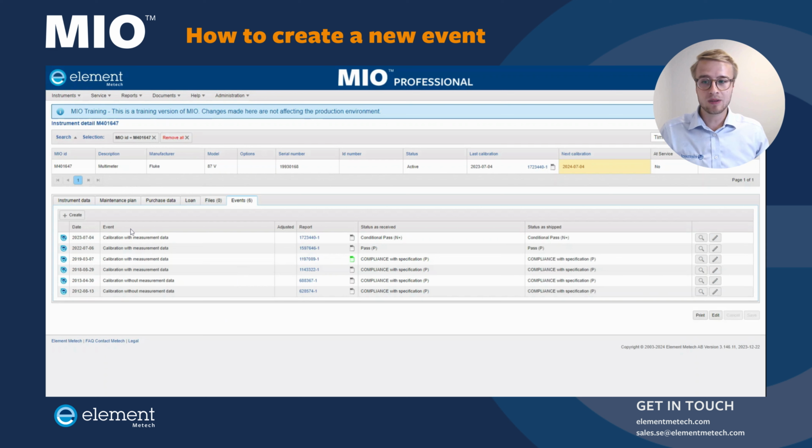So now I'm going to show you how you can create an event. And before that, I just want to note that if you send your instruments for calibration to one of Element laboratories, we will automatically upload the calibration event for you. But let's say that we perform this calibration ourselves internally. I will then click on the create button here.